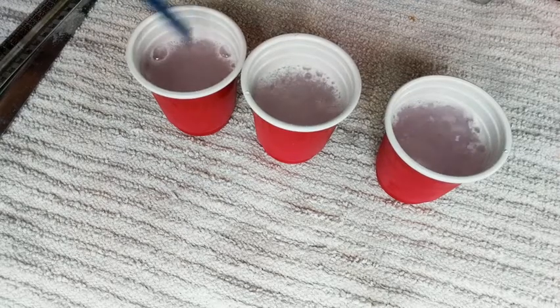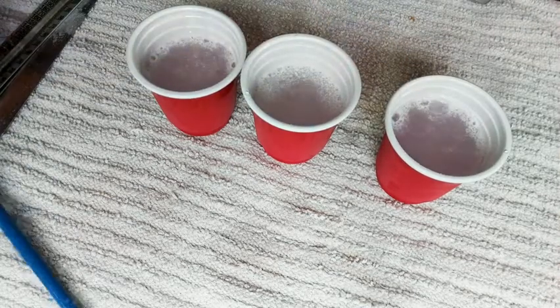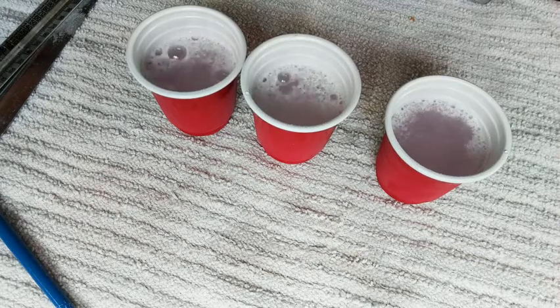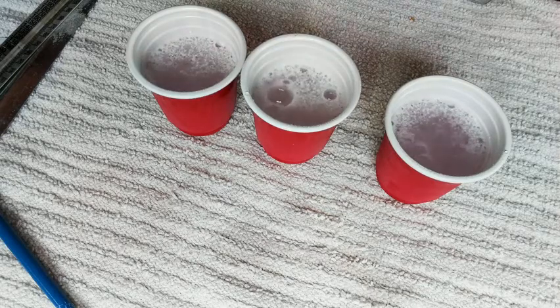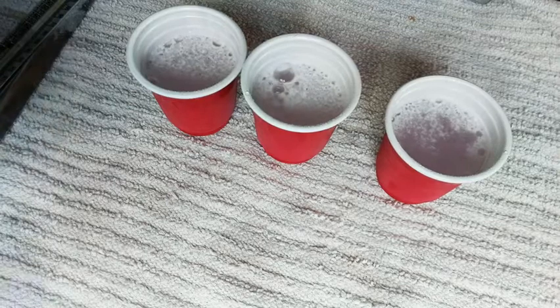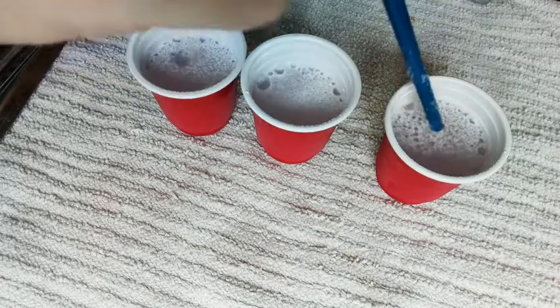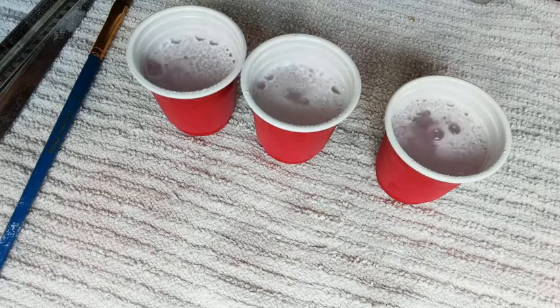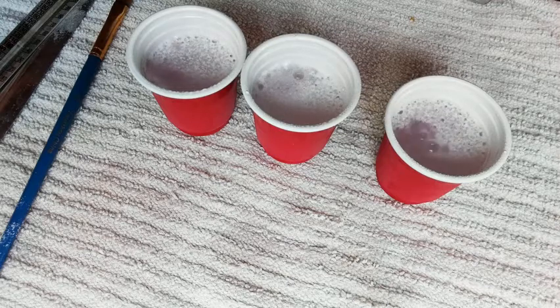So we're still seeing the tablets at the bottom right now. It's definitely a slower reaction, you can tell. The second one, the hot one, was going to almost go over. We still have pretty good size tablets at the bottom. That's kind of what we're trying to make sure is dissolved. They should still float like we saw earlier once the reaction is finished.